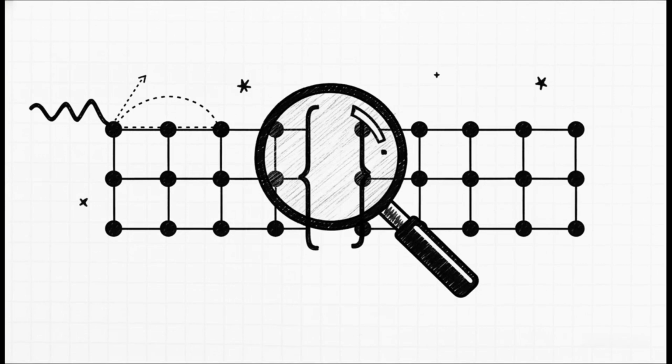The lowercase n is just an integer representing the order of diffraction. The Greek letter lambda, that represents the specific wavelength of the X-ray we're firing from our tube. Then there's d, this is the big prize. That is the interplanar spacing, or the actual physical distance between the layers of atoms in our crystal. And finally, theta is the Bragg angle, which is the angle our incident beam hits the sample.